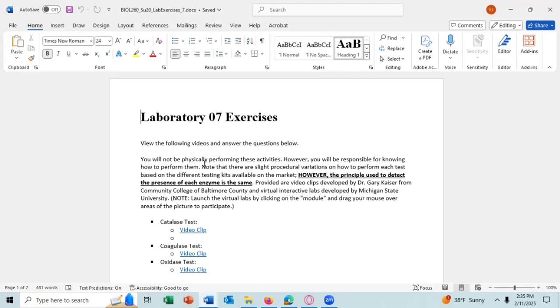Any question about any of that? So take a look at the results and the table of the unknowns and figure out which next test to request and request it in your unknown notes.